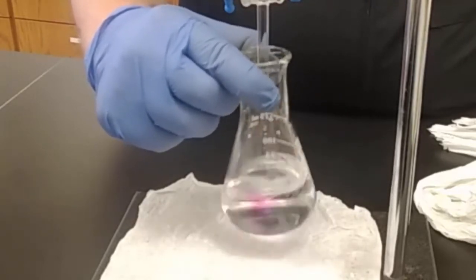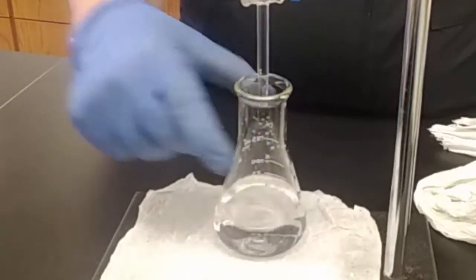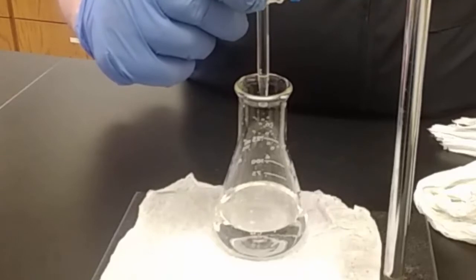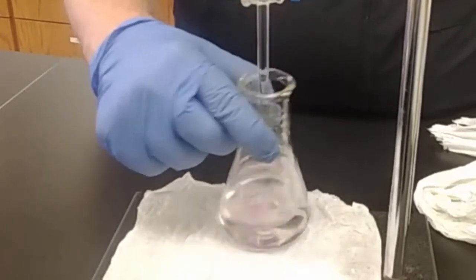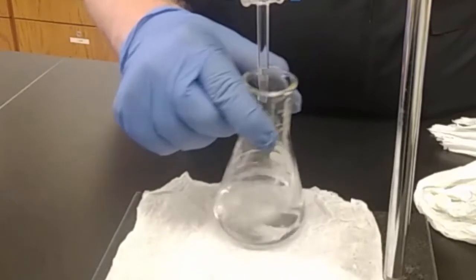It's got to persist for at least 30 seconds. You want to say 30 seconds because if you leave it longer than 30 seconds, it can sometimes turn back colorless because of, again, carbon dioxide in the air reacting to form carbonic acid, and it'll turn back colorless. Not that I recommend this, but it's entirely possible.